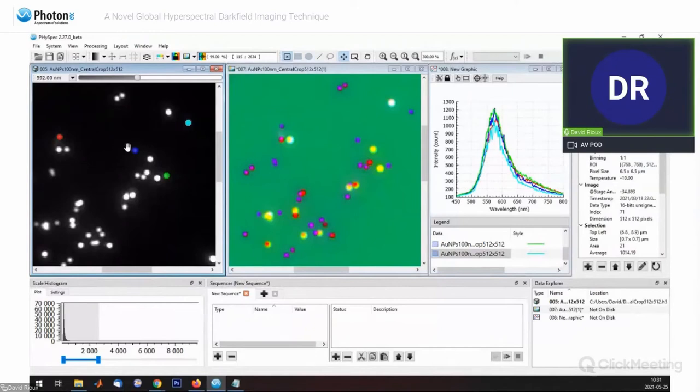And if we move a bit and we check different nanoparticles, so I'll move the red one here. I'll go on this red, the one that appears in red in the PCA. So as you see, the spectrum is a bit different. It's more intense and it's a bit shifted. It's a bit red shifted relative to the other.